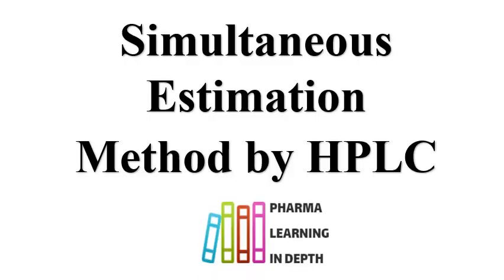This is the short information and understanding about the simultaneous estimation method by HPLC.